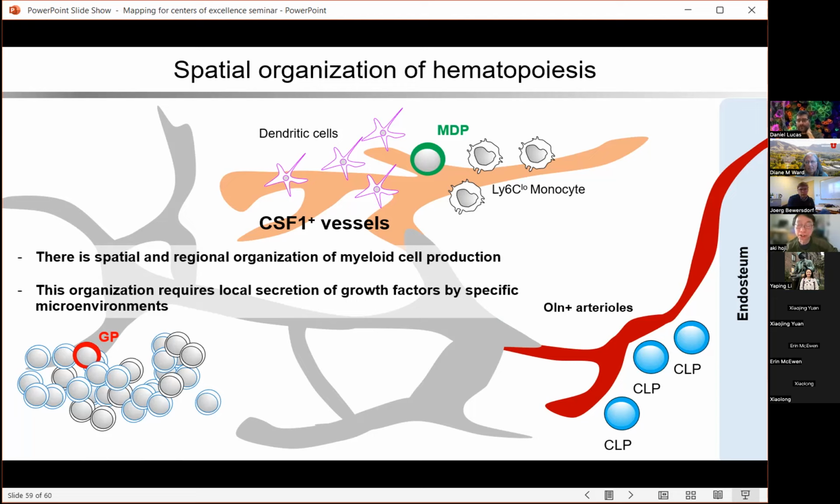Well, PhenoCycler doesn't have the 3D. No, it does not. But you can make one yourself, using low technology approaches.